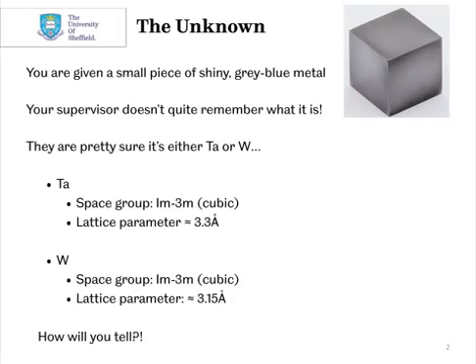They think it's probably either tantalum or tungsten. Tantalum and tungsten both have the same space group, Im-3m, both body-centered cubic, and the lattice parameters are quite similar as well: 3.3 angstroms for tantalum and around 3.15 angstroms for tungsten. So how are you going to tell what this metal is?